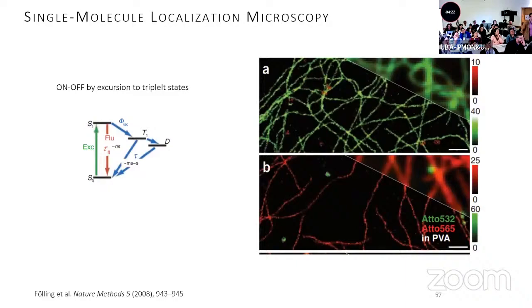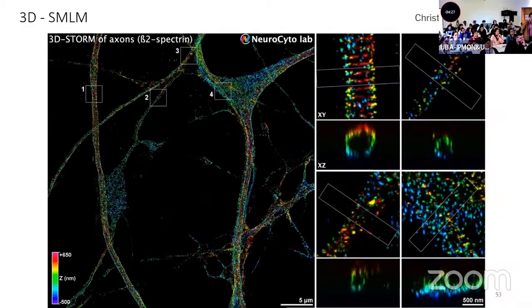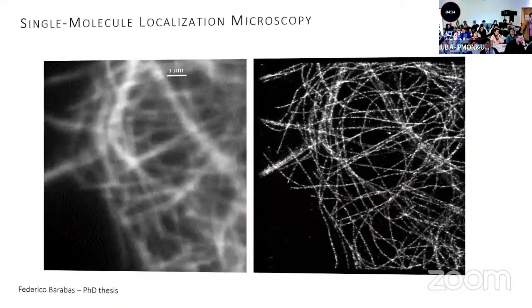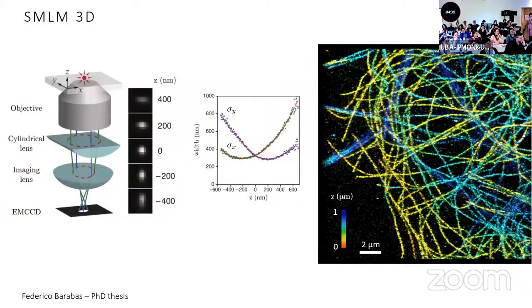So basically your illumination, let me come to this slide. So you use wide field illumination. In the illumination, there's no information. Everything is the same. Now you make an image with a microscope. When you make an image, you are selecting a focal plane. That focal plane is diffraction limited. So basically, you're imaging on your camera a plane that has a width of about 500, 600 nanometers. That's where your molecules will look bright and round. If they are out of that plane, they will look out of focus.